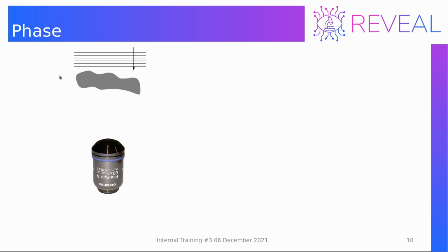So let's now imagine that we have a biological sample or any phase sample, and we have a plane wave which falls on this sample.